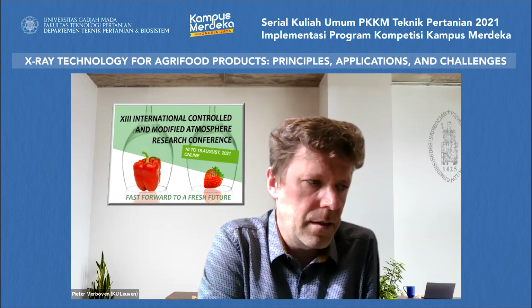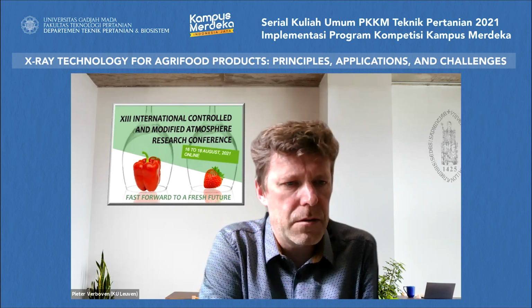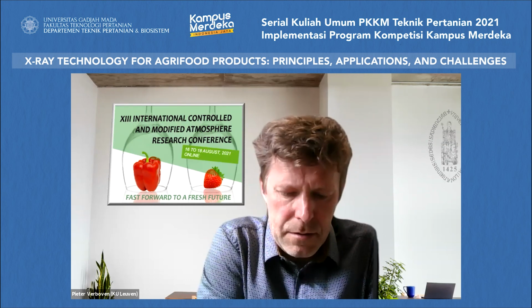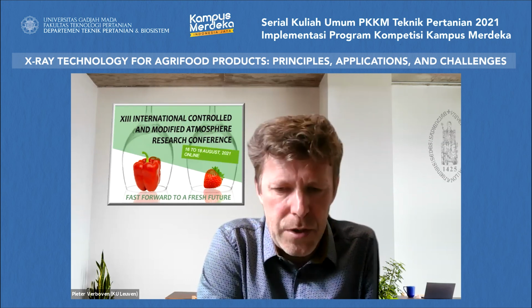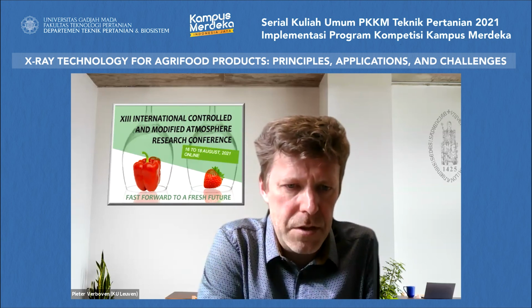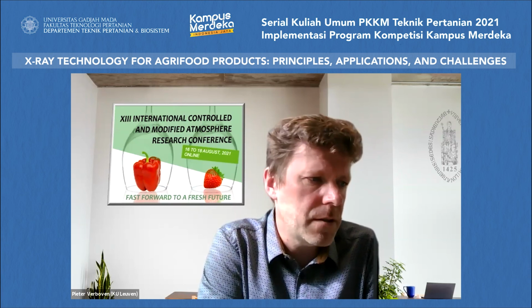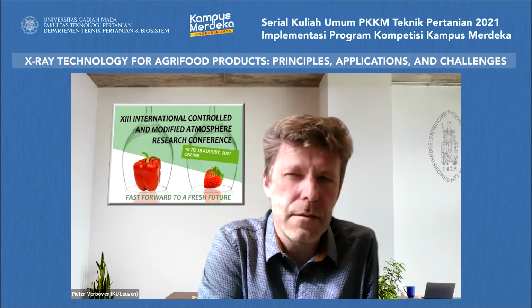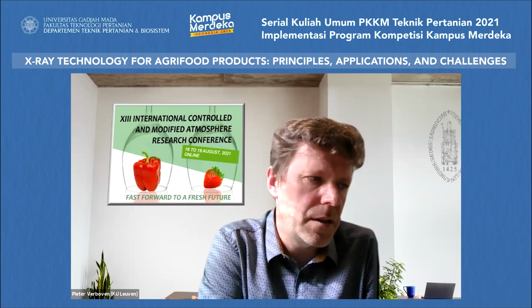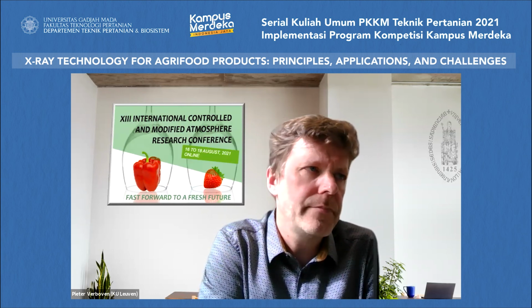So they invested in it, and we did the whole application around it, because the CT companies just give you the instrument, able to generate the images, but they will not give you everything else that you need to process the data. So you need to be aware of that. You need to find a partner that is able to develop the algorithms to process the data for you.